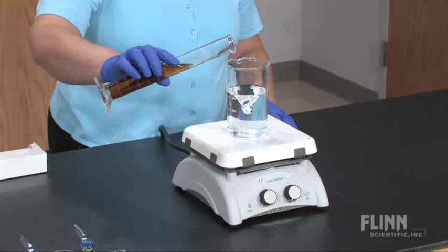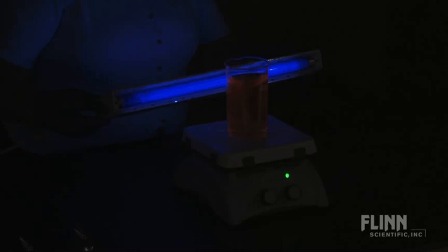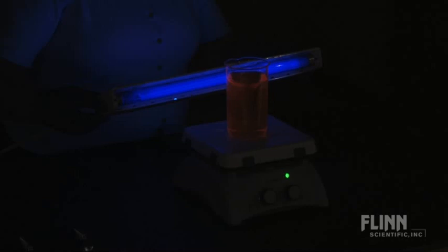The reaction is classic redox, but nothing happens until you add transition metal catalysts, in this case, ruthenium and cerium. Both transition metals have two different color oxidation states. The solution oscillates between green and a bright fluorescent orange due to ruthenium-2 complex ions.